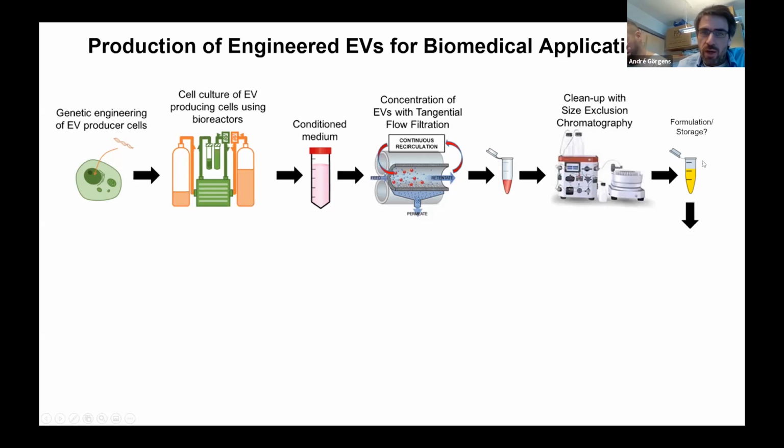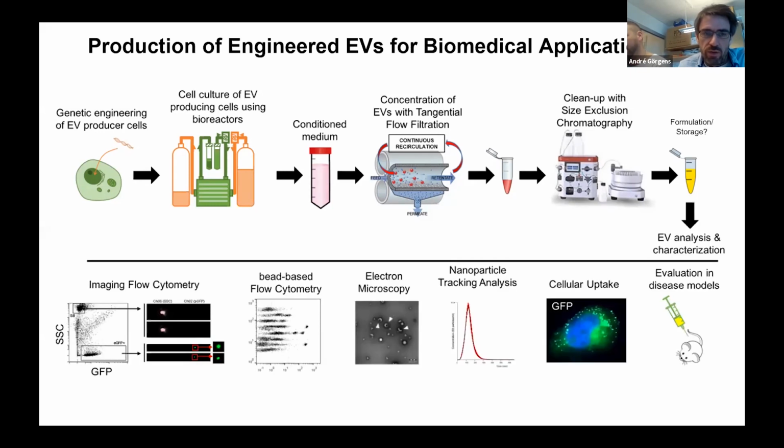So it's just incredibly helpful to have appropriate and sensitive analytical methods for all these decisions that you make, because otherwise you make less informed decisions. And of course we use different methods to study function, to compare constructs, to measure size and concentration of particles, to do proof of concept electron microscopy. And what has been especially helpful for basically all projects at the end is flow cytometry.